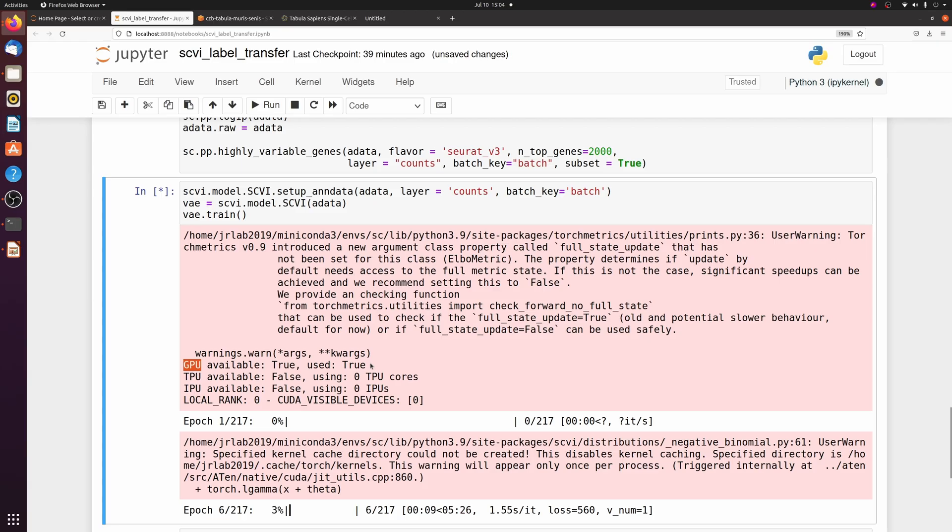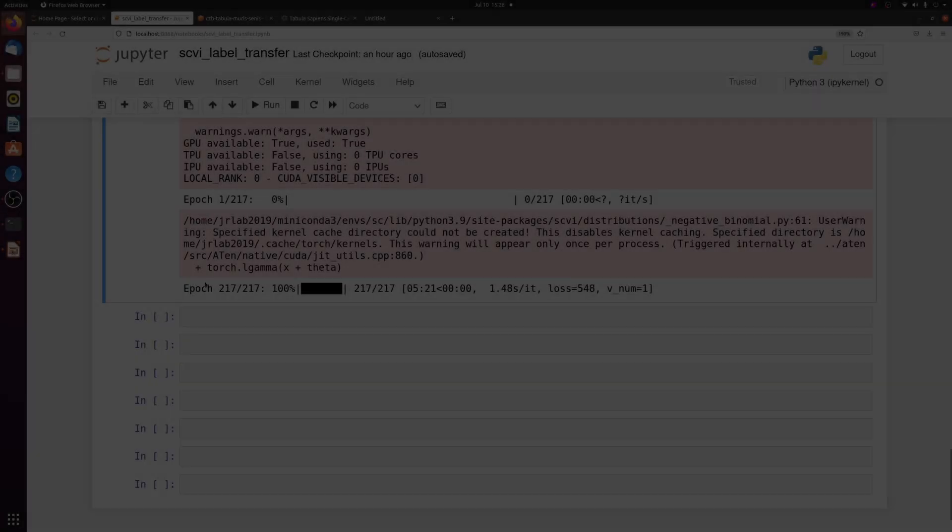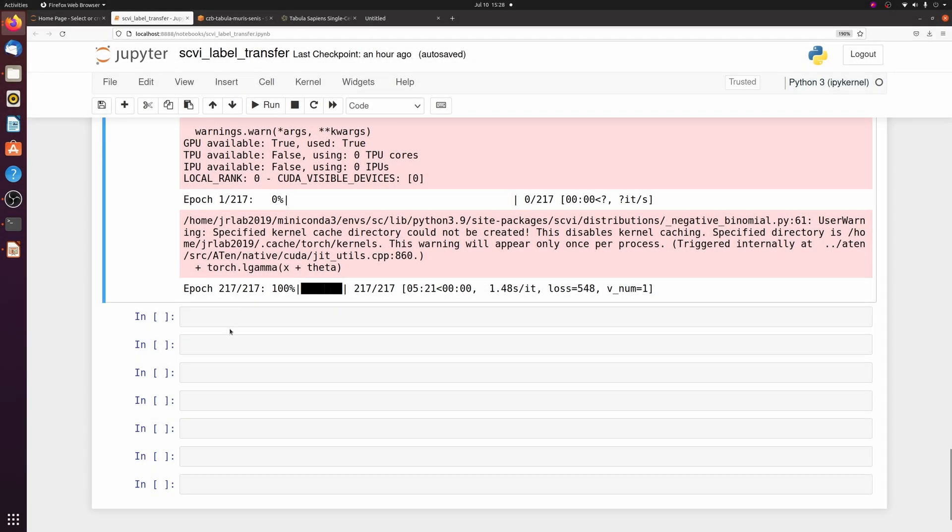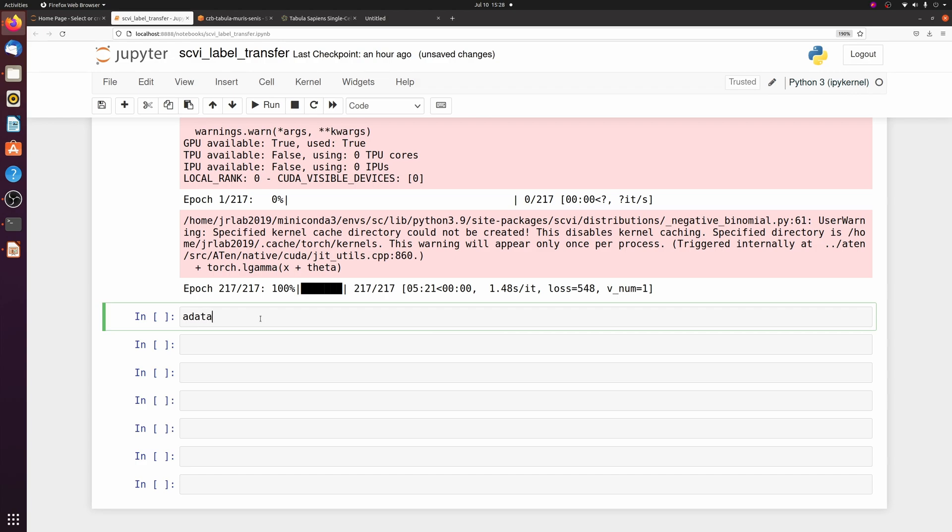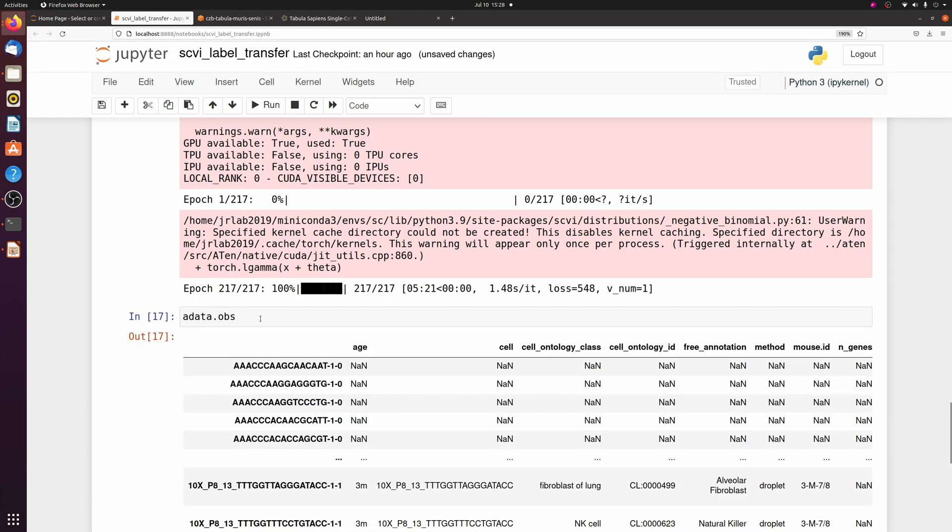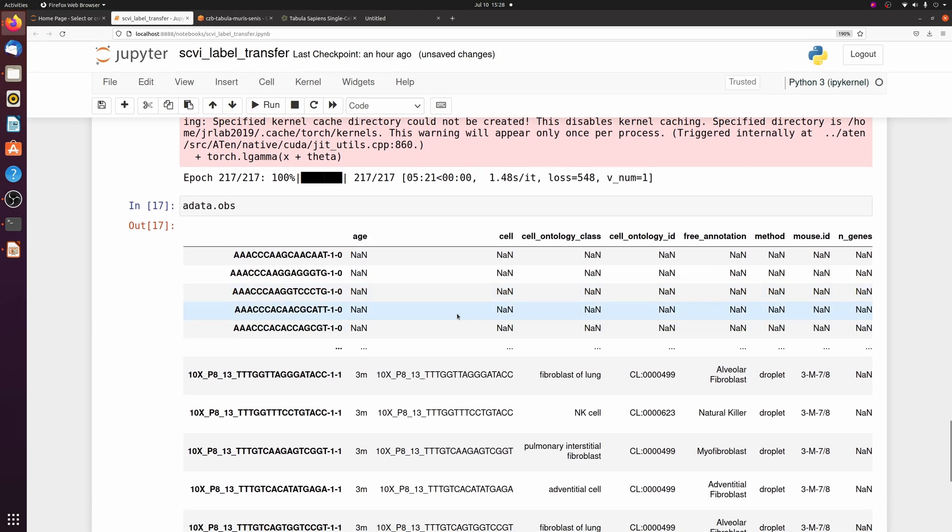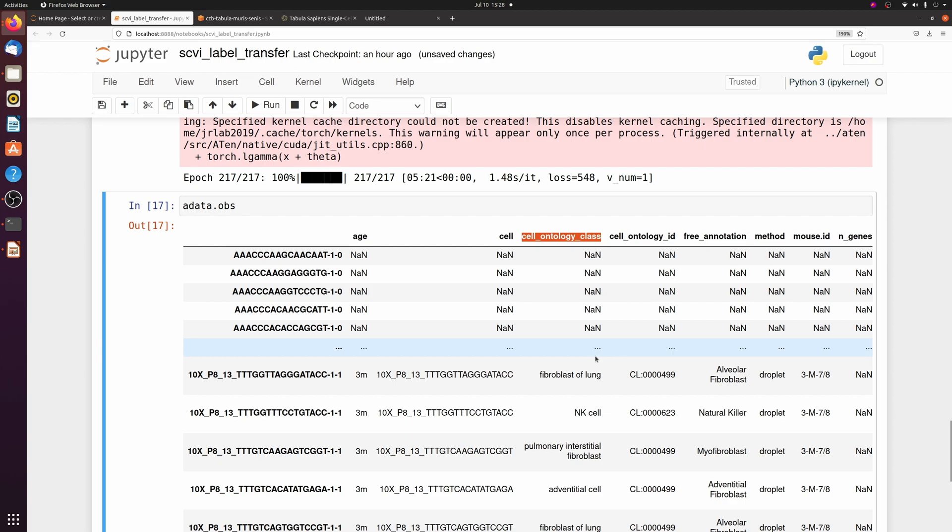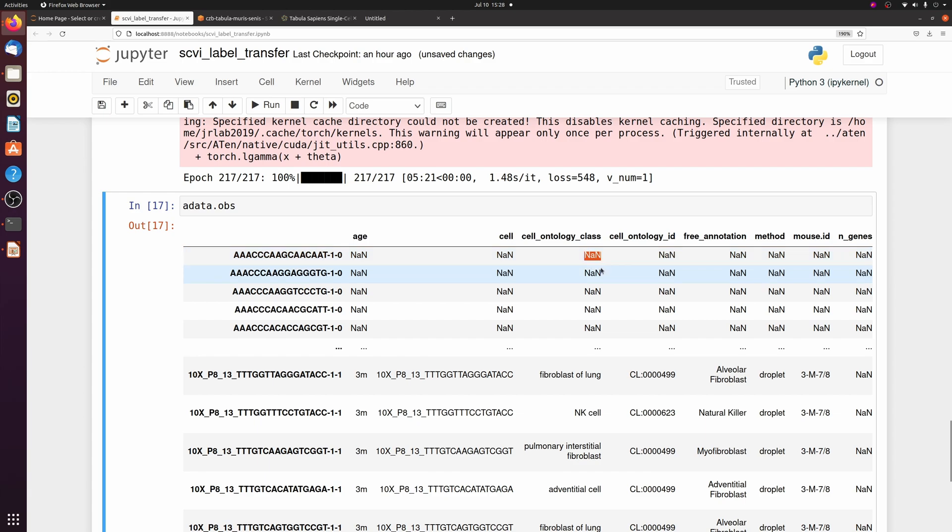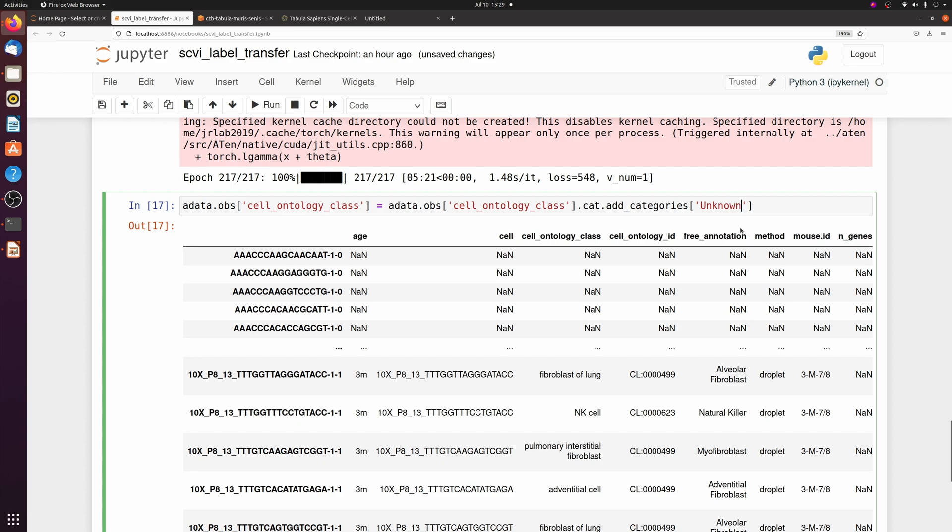Okay, now that that's done, we have to do one quick cleanup step. If we look at the observation dataframe, we're going to be mapping the cell ontology class, so we need to replace these NA values with a string. I'm just going to replace it with unknown. But first, since it's a category column, we have to add a new category and then we can fill all the NAs.